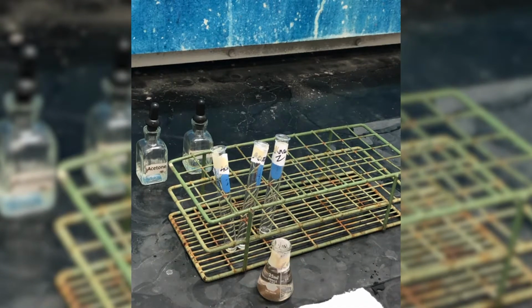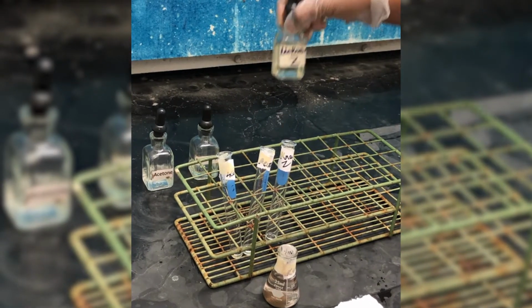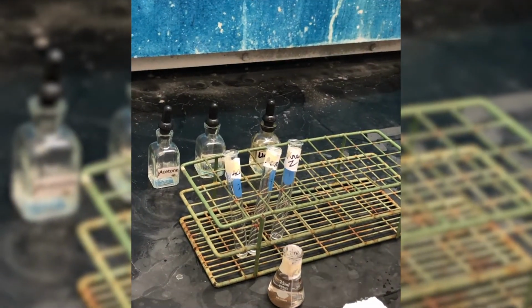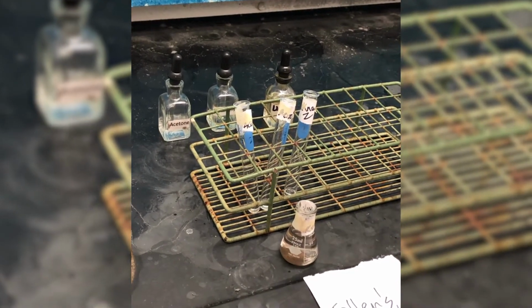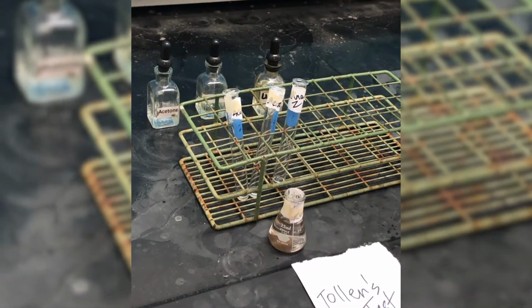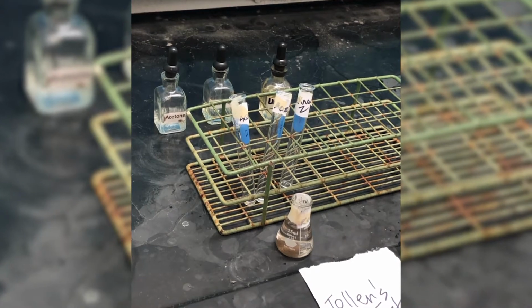So the possibilities for our unknown Z is that it's either a ketone or an aldehyde. Your unknown Z should be identified as a ketone or an aldehyde. That means you want to identify the functional group of your unknown.